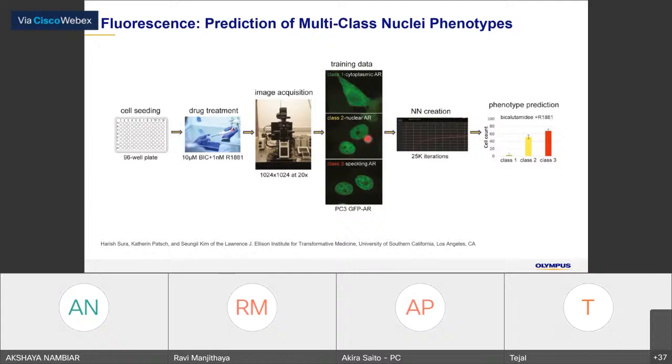But in this one, there are some speckle objects inside the nucleus. So we train the neural network to identify these three different kinds of objects, create the neural network, and apply it to the real samples that the researcher wants to analyze.